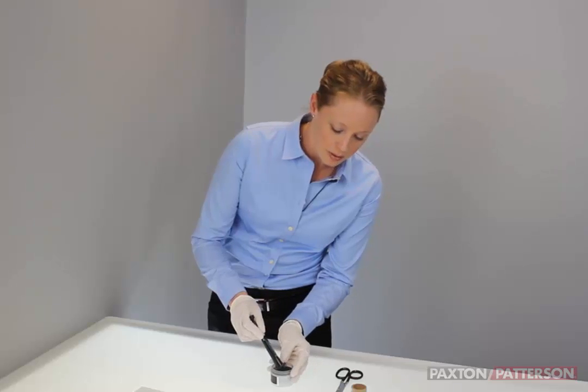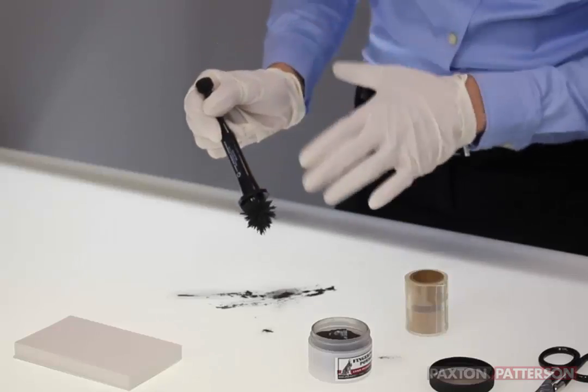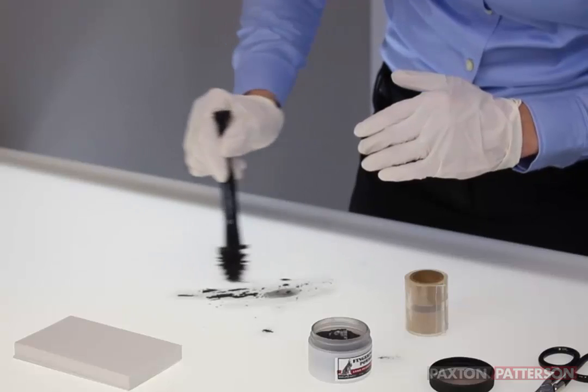We'll pick up some fibers and we're just gently going to fingerprint the surface that we're interested in. Keep in mind that the wand itself should never actually touch the table — it doesn't need to. We just want the magnetic fibers running over the print.